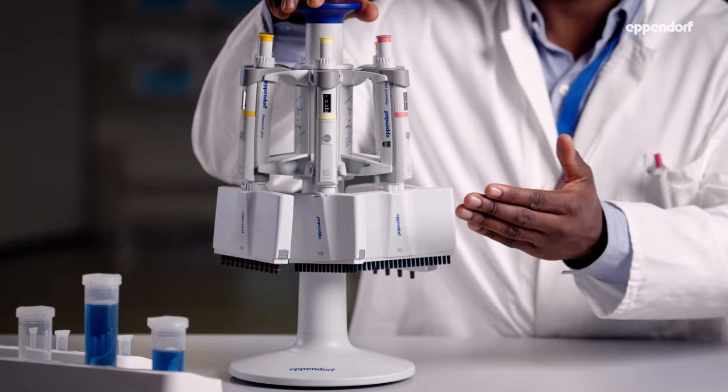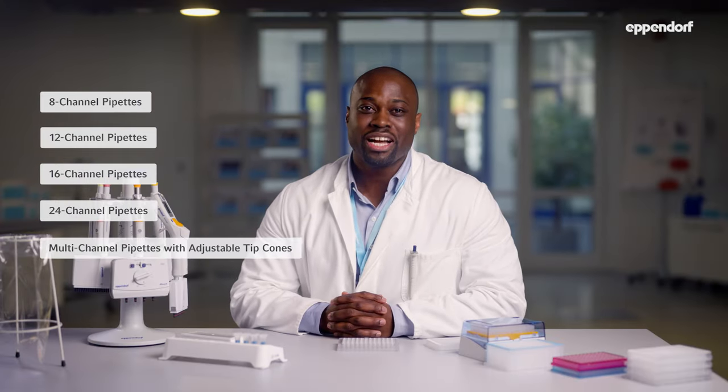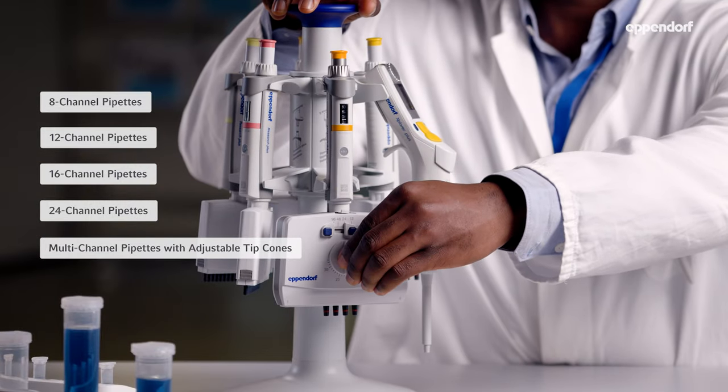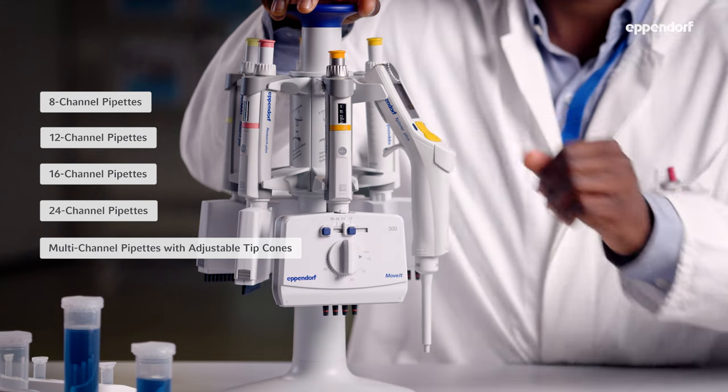Let's talk about multi-channel variants first. Multi-channel pipettes are usually available with eight channels to help you fill PCR strips or 96-well plates by rows, 12 channels to help you fill 96-well plates by vertical columns, or 16 and 24-channel pipettes that are perfect for filling 384-well plates. Eppendorf also makes Move-It pipettes, which are multi-channel pipettes that have adjustable space between the cones. These are perfect for moving multiple samples between different kinds of containers.